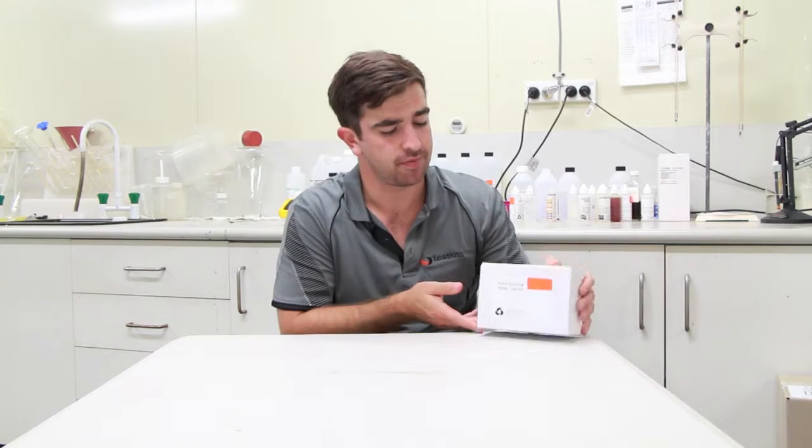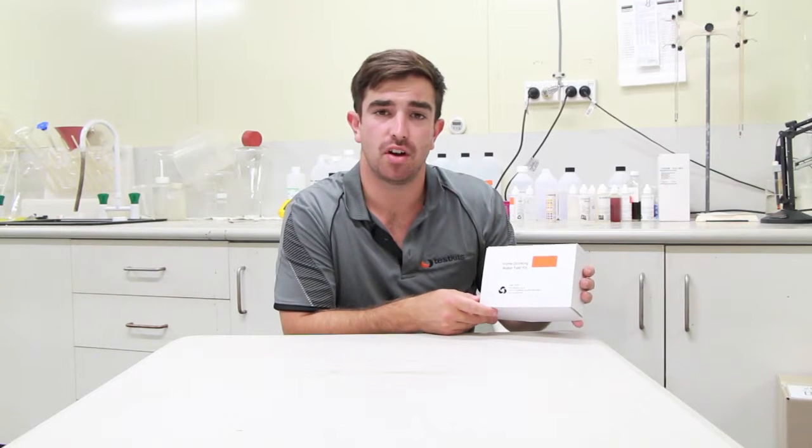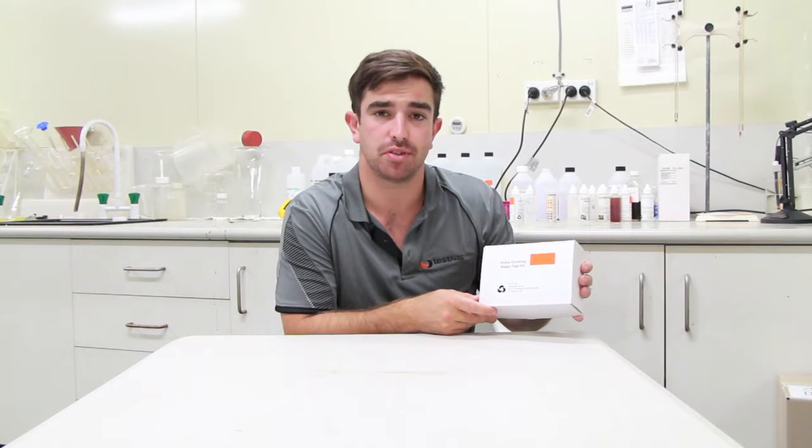Hi, I'm David from testkits.com.au. Today I'm going to introduce you to the home drinking water test kit. Our test kit tests with nine different parameters which are important to your family's health.